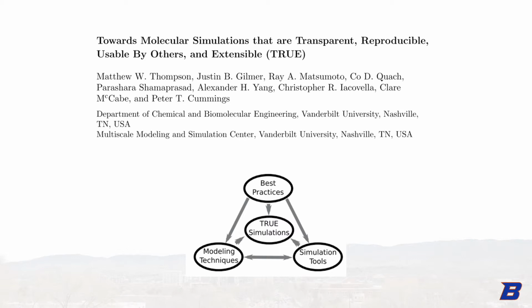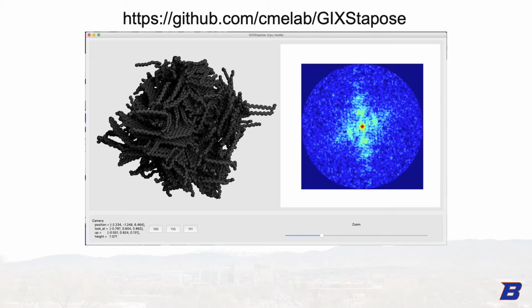And so we can use the principles of true, and we can use open source software, unit tests, continuous integration, and scriptable workflows and documentation and examples to help to make our workflows better. So we have aimed to keep true principles in mind when addressing the limitations of diffractometer, namely connecting of the views of the real space structure with their simulated diffraction pattern, and making it easier to diffract from any arbitrary angle. And the result is the GIXStapose library.